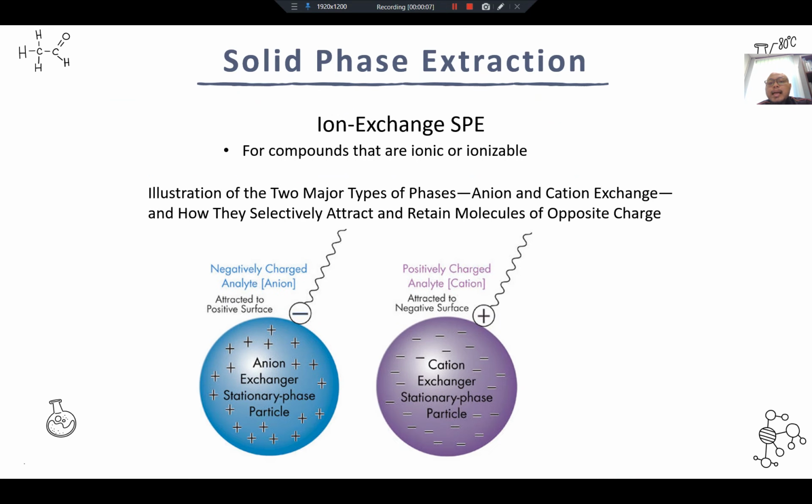We have also the ion exchange SPE, specifically if we want to extract ions. Okay, kadang-kadang you tanya, oh bila you guna ion exchange ni untuk ion? Contohnya you nak detect arsenic, ataupun you nak detect low explosive compound, which has a lot of inorganic chemicals inside there. So you can use the ion exchange SPE for the purpose of removing interference and concentrating them.